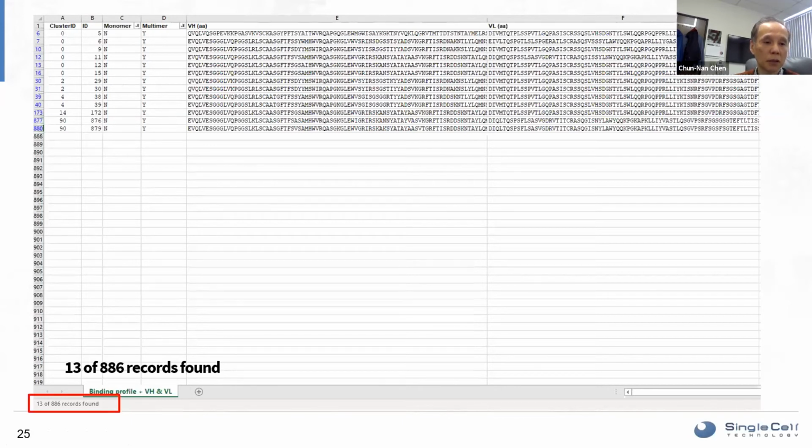But obviously, if you look at this 14, where's my mouse? This obviously came from a family. So for an interesting reason, because of the sequence differences of this antibody family here, this one member in the family ID 14, this particular antibody will bind to the multimer, but not to the monomer. But there are obviously some other members that will bind to the monomer here. And you also look at the 90, which is another family here that binds.